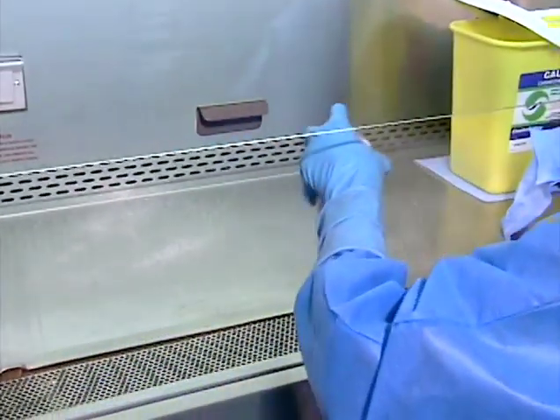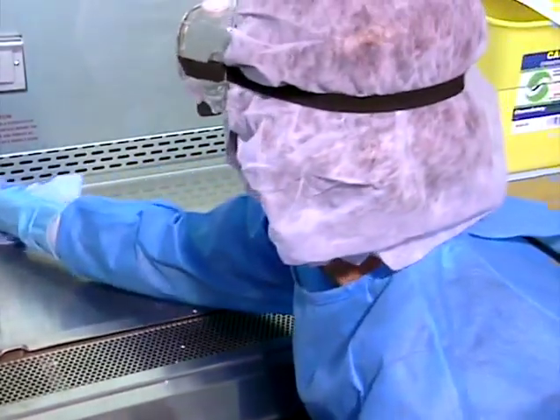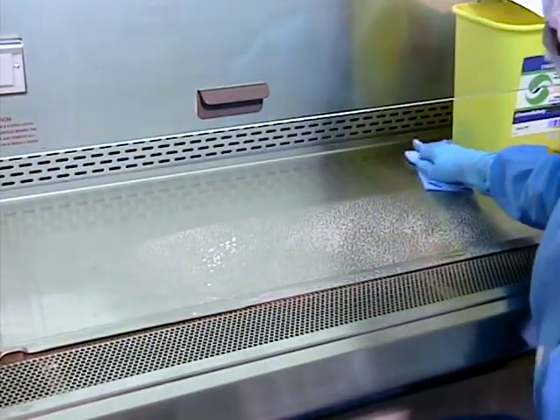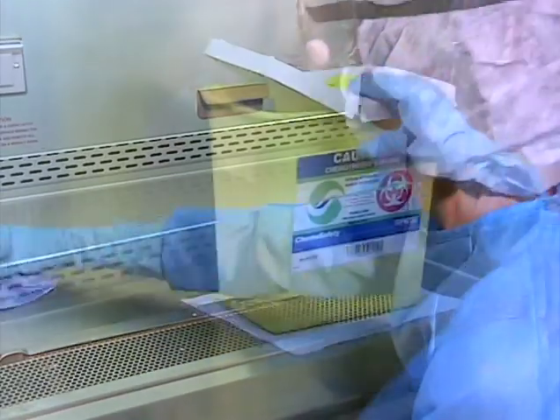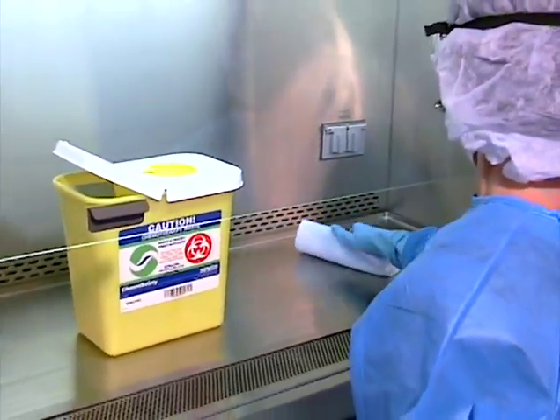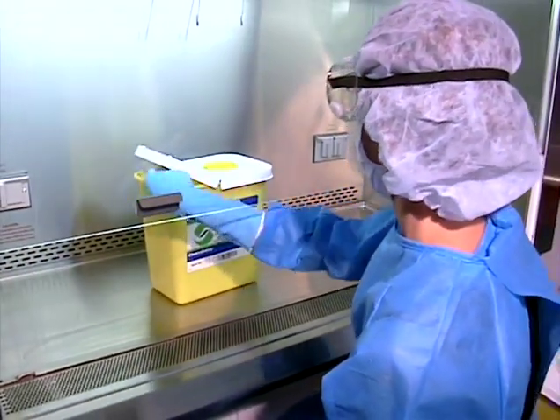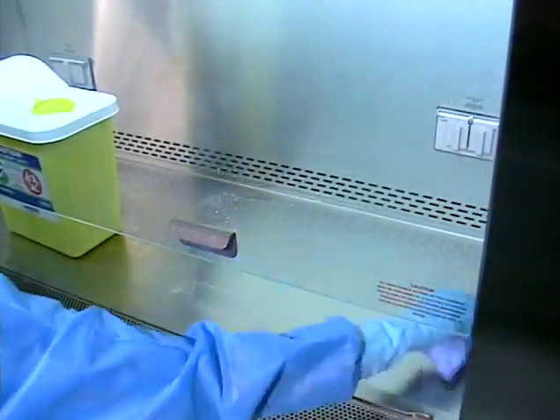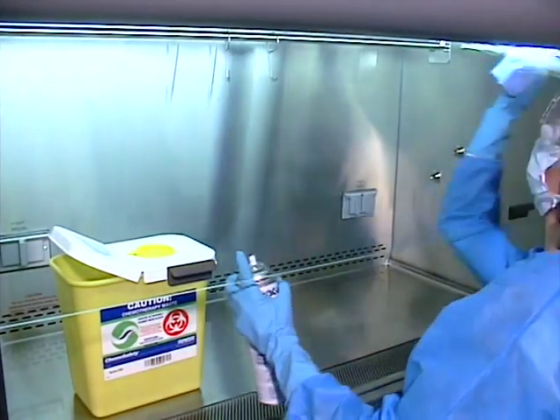Clean the top of the work surface and back grill if present. When all of the work surface except the area where the waste container is sitting has been cleaned, move the waste container to a cleaned area and pick up the mat by pinching it near the middle so that the dirty underside is folded inside, and dispose of it in the waste container. Clean the remainder of the work surface. Clean the inside of the view screen.